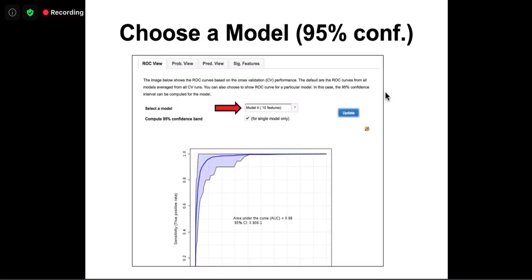Jeff, sorry. Is there a risk of information leakage if we select the most important features to predict the model? Yeah, this is what I just mentioned: you have to do the feature selection within each fold. You cannot do the selection using the whole data. So if you select the features within that two-thirds, okay? And use those features to predict the one-third that doesn't use the selected significant features, then you're not going to leak.